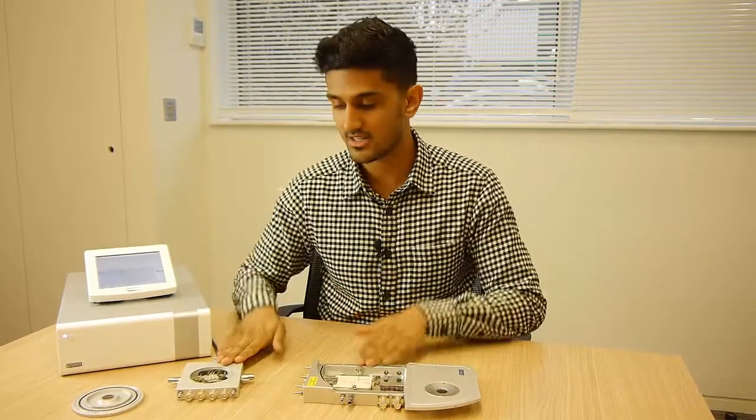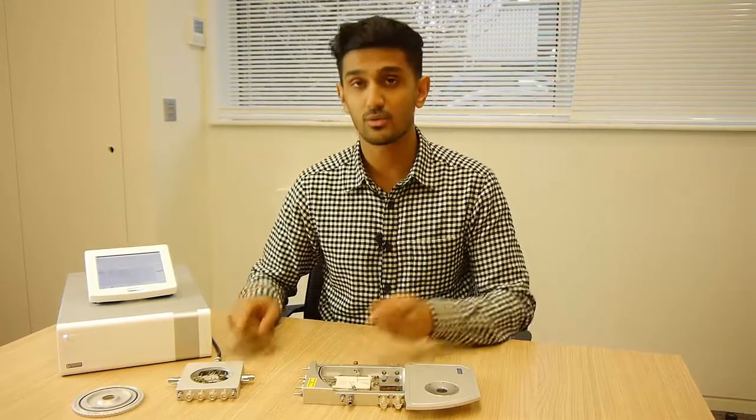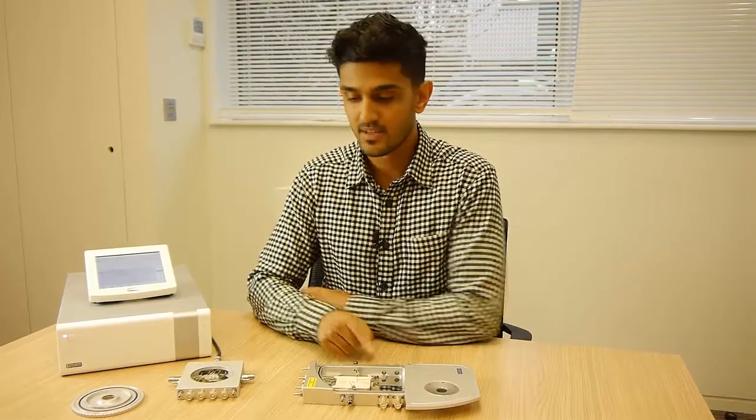The temperature range for both these stages are different. Both of them will reach minus 196 degrees Celsius with liquid nitrogen cooling. The HFS will go up to 600 degrees whereas the LTS will go up to 420 degrees. If you've got any other questions regarding these stages or anything else then please don't hesitate to contact us.